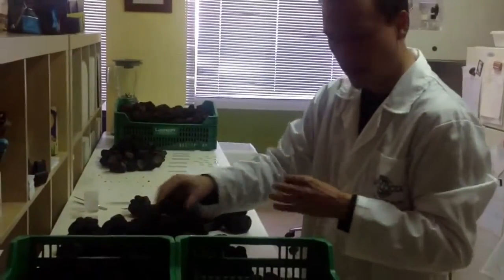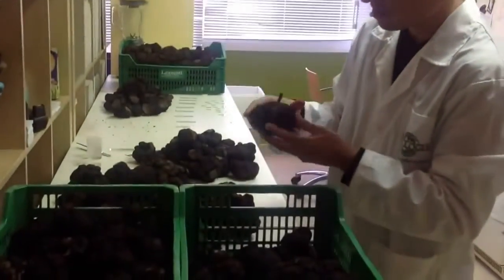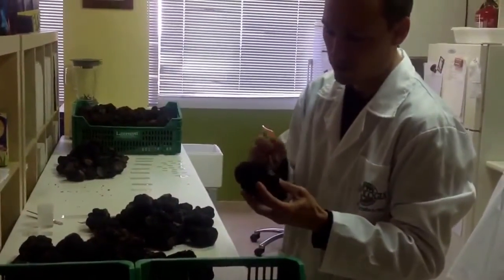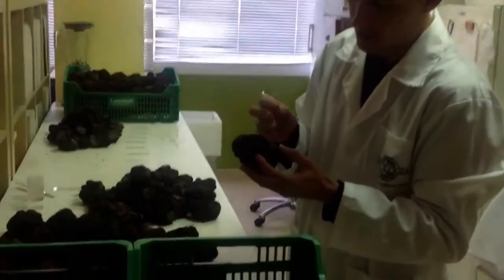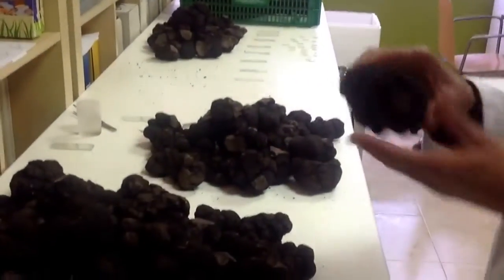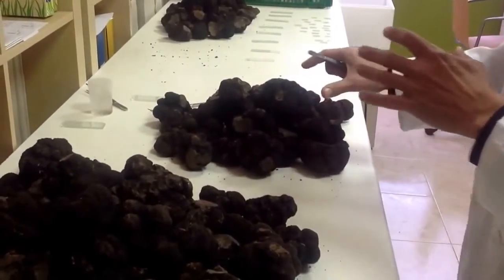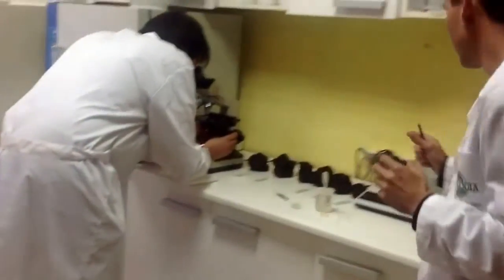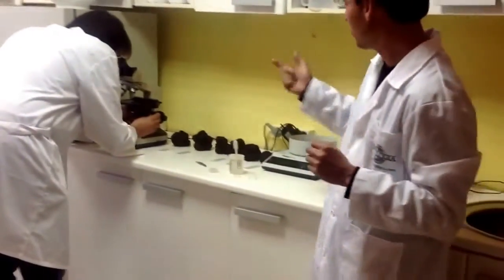Here we have another truffle of around 200 grams with a nice shape, quite mature, and no holes. This one will be used for the next step: checking every single truffle at the microscope, which is what my colleague is doing.